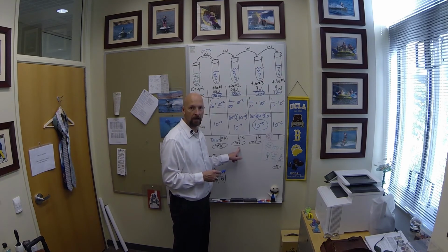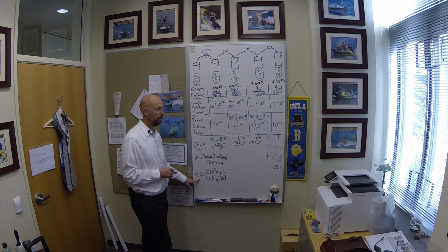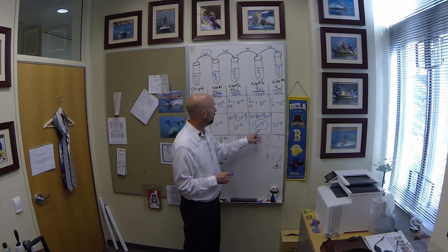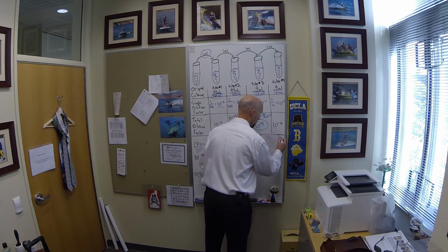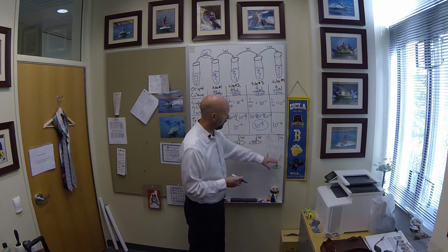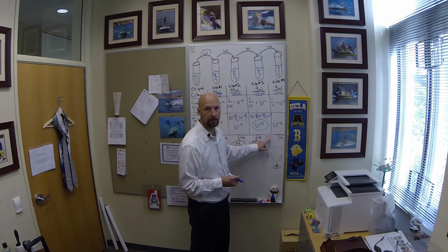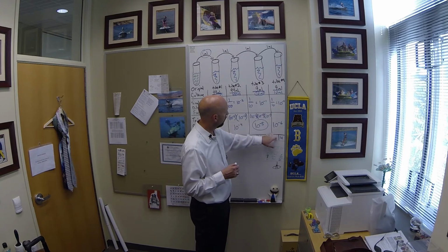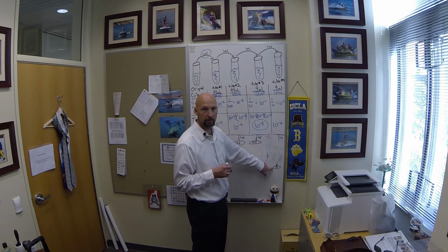756 falls outside of our magic number range, which is between 30 and 300. So this number right here is not a good number to use to determine our original culture density. And in tube number 4, we plated 1 mil. I didn't write it here. I have to work around this picture because this is a picture that my daughter drew a couple weeks ago, and it says, do not erase. So we've got 1 mil from tube number 4, but we only have 12 colonies, or 12 CFUs. Too few, right? Less than 30.